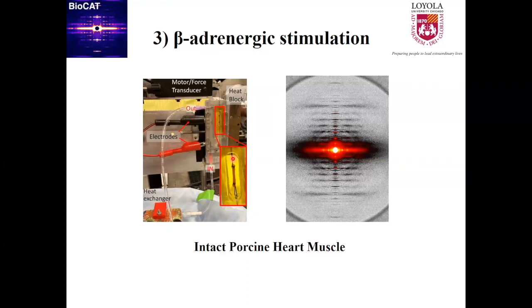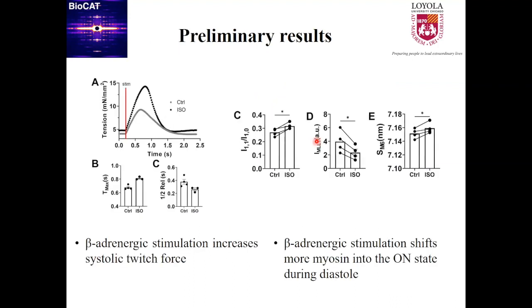It's stored in the heart transplant solution that is good clinically for 6 to 8 hours. We collect X-ray patterns during this 6 to 8 hour window. And this is the X-ray pattern, which is good and typical. Most of them look pretty good. So I just want to show you some very preliminary data we did with the isoproterenol treatment.